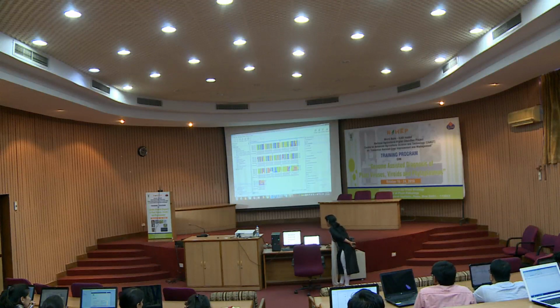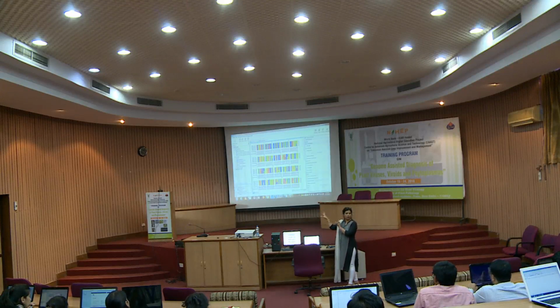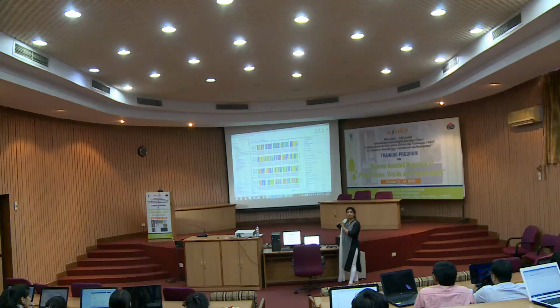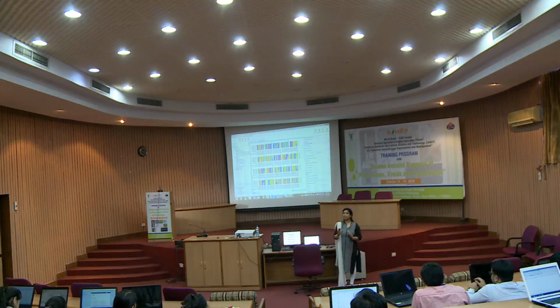After this, the file which I will be showing you is another file that has already been trimmed and checked, and each base has been verified using the chromatogram files. So, now these are ready-to-use files to submit to GenBank, correct. Any confusion up to now?